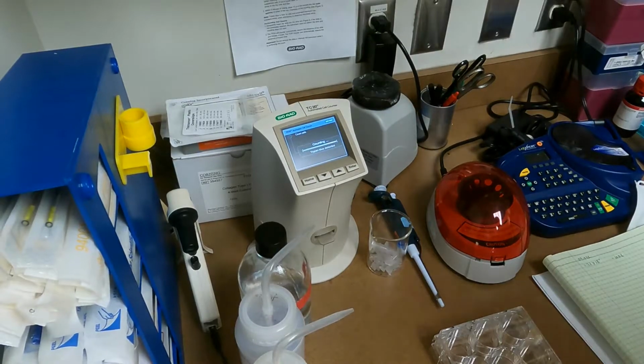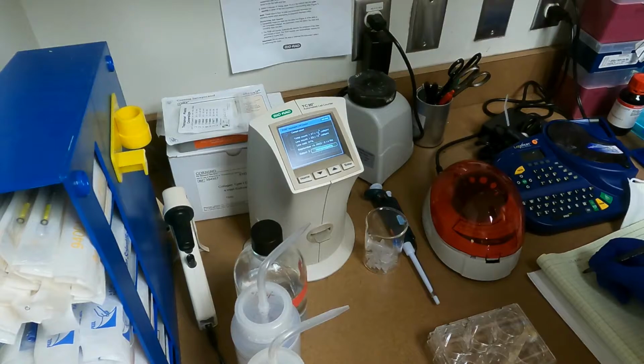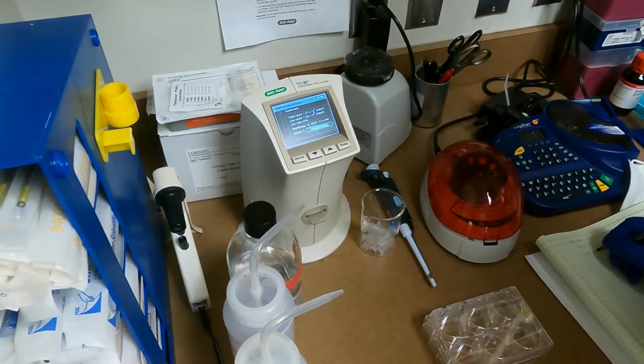So Trypan Blue is a carcinogenic dye. You've got to be quite careful with it. So it's 1.27 this time, and 97%. We'll call it 100%. All right.